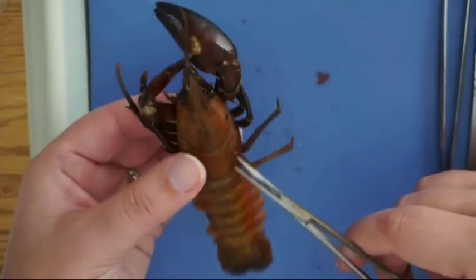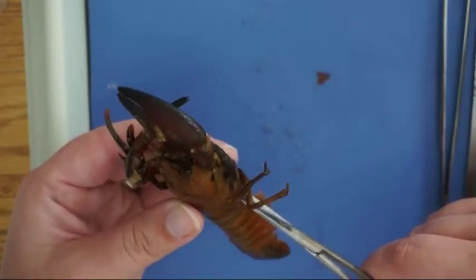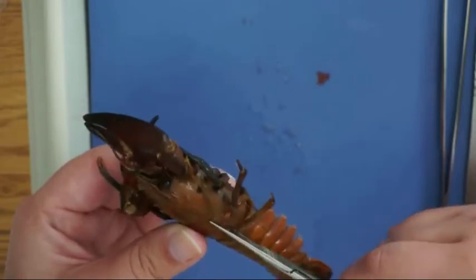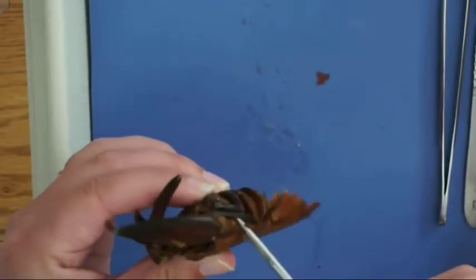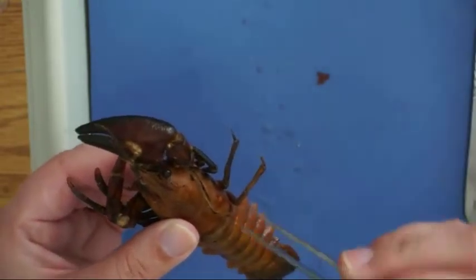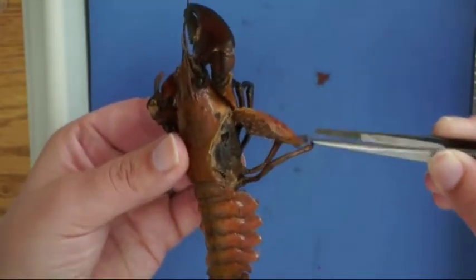Now we're going to look at the internal anatomy of the crayfish by making a C-shaped incision along the side of the carapace. I'll show you what that looks like on both sides, and then we'll make a cut down the middle. You don't want to cut too deeply — just through that outer carapace. And I'm going to pull that off.